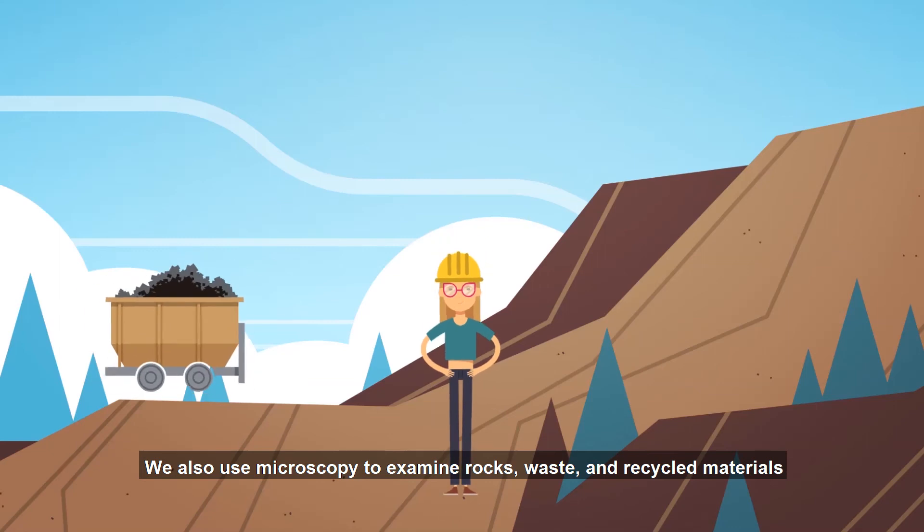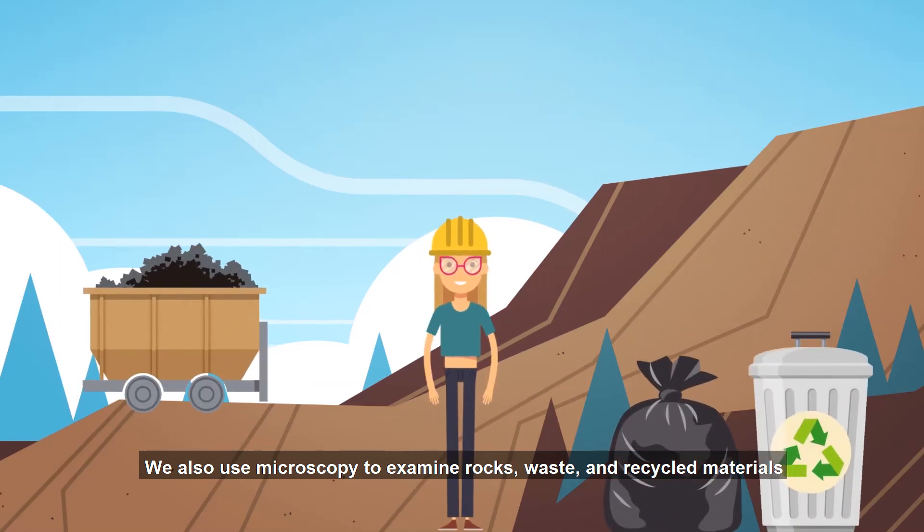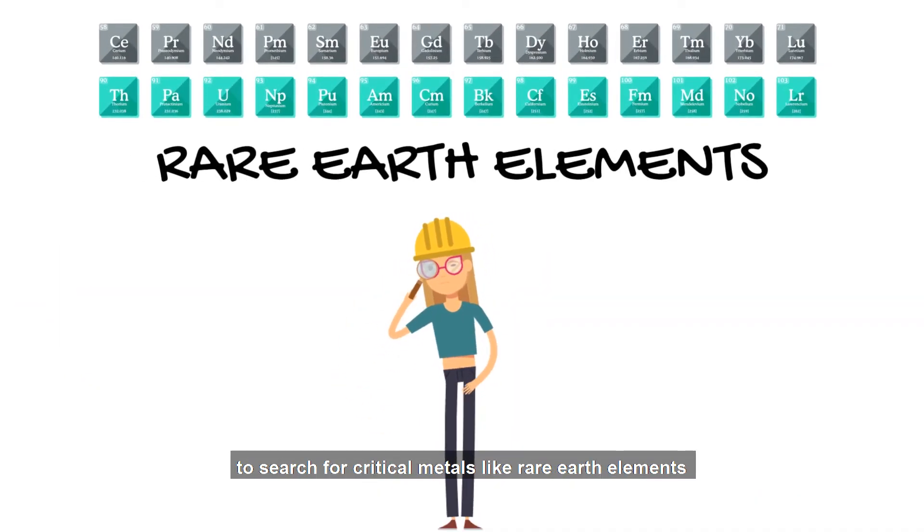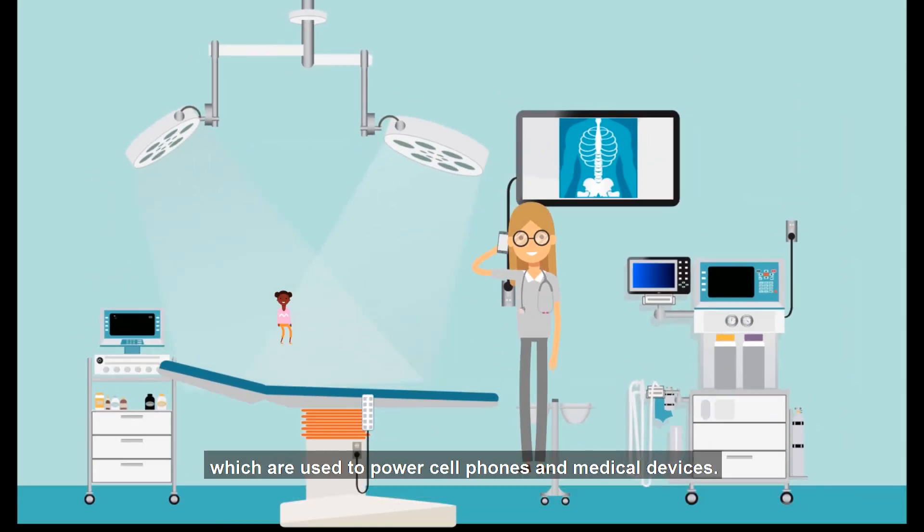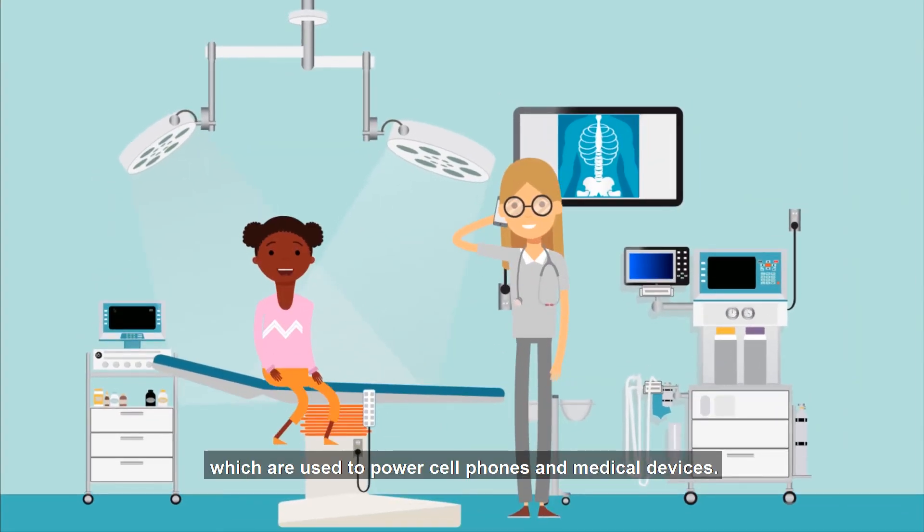We also use microscopy to examine rocks, waste, recycled materials to search for critical metals like rare earth elements, which are used to power cell phones and medical devices.